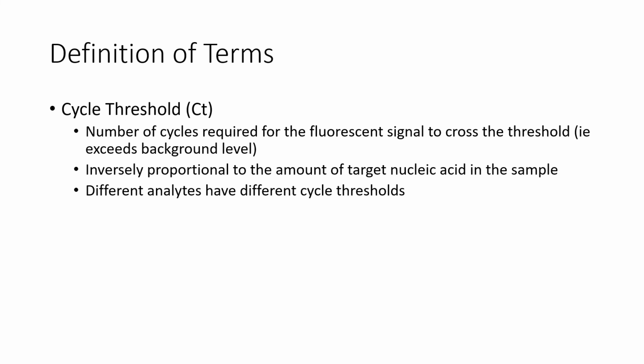If the virus is found in a low number of cycles, let's say a CT value of under 30, it means that the virus was easier to find in the sample, and that the sample started out with a large number of the virus. Meaning, the sample has a large amount, a high viral load to begin with. So, think about it.